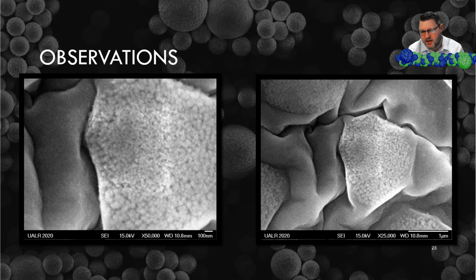The image to the right, the exact same image, just instead of 50,000 times, it's 25,000 times, and that kind of backs out where you can see what you're looking at, and just incredible detail on these nanostructures here.